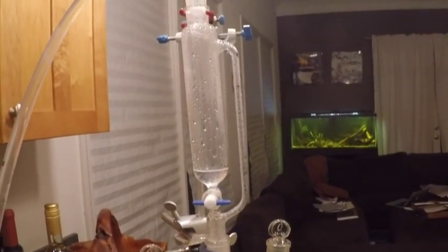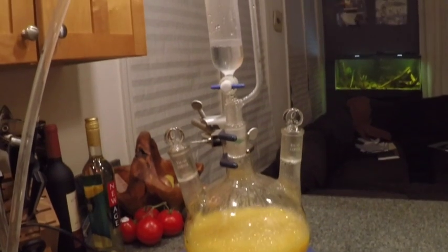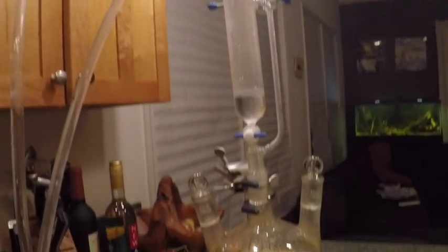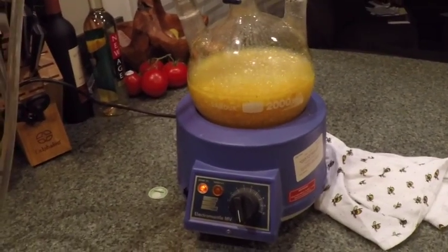We're condensing all the way up in there. My intuition tells me we're pretty close to the end of the distillation and there's probably not much more oil to come out of those peels. So let's turn it off and let it cool down.